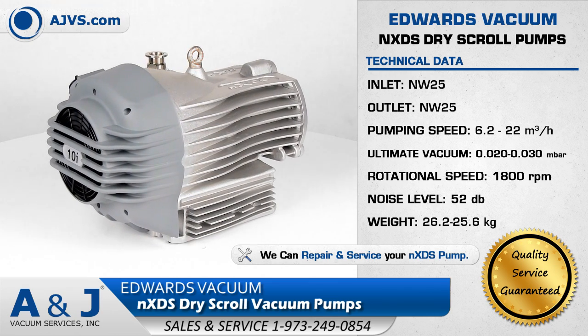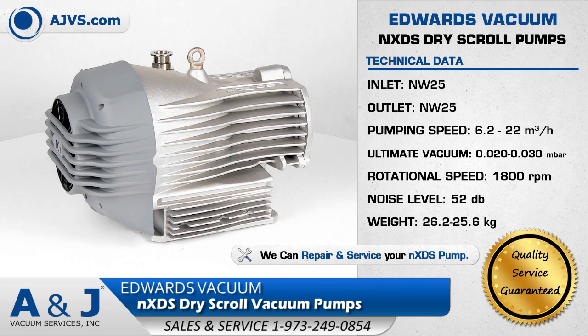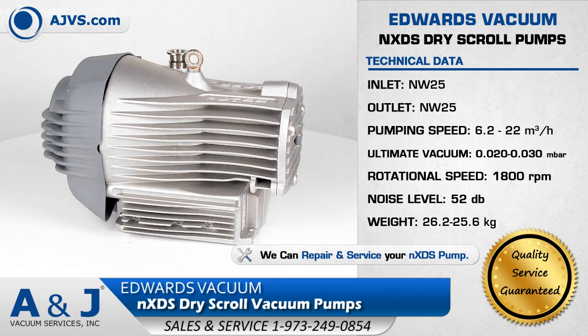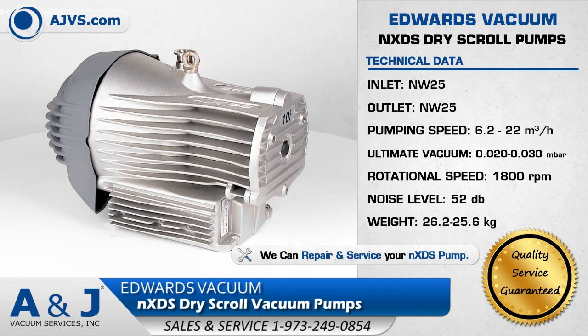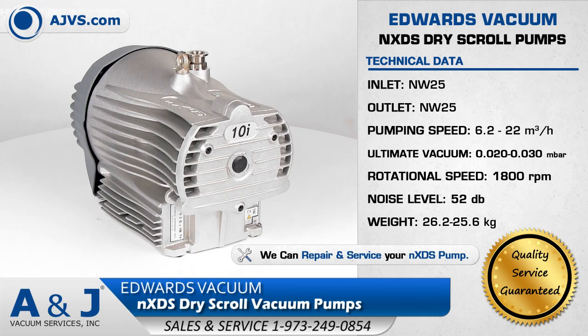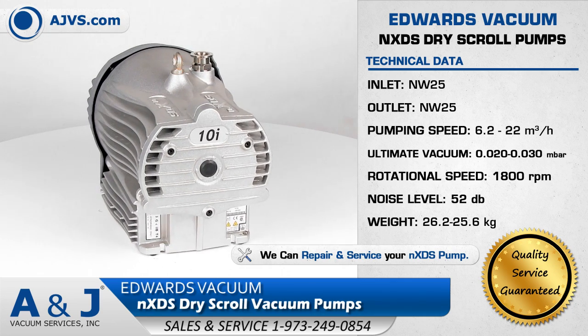The Edwards NXDS has a pumping speed range of 6 to 20 cubic meters per hour and is extremely quiet with an operational level of 52 decibels. It has an intuitive user interface and long service interval, making it an efficient dry pump for today's most demanding work environments.